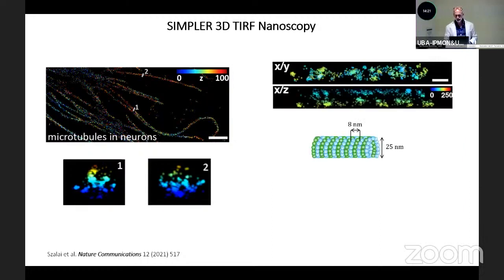And also, remember that we wanted, for example, to achieve sub-10 nanometer resolution to try to detect the supramolecular structure of tubulin, for example, this periodic structure. Well, we tried. This is what you see here. These are plain cross sections of microtubules. We need to find a microtubule that is more or less aligned, right? That is not too curly. And then we can plot it and try to see if we see the structure. We don't see it, okay? We cannot see it. Why?